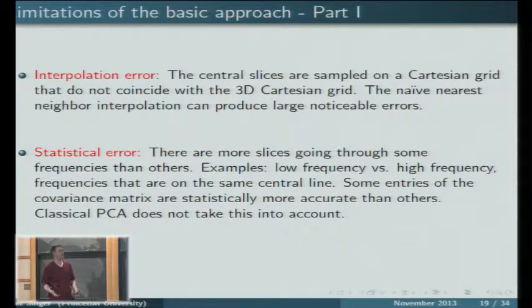And by doing so, we introduce some error. And this error is going to get larger and larger as we go to high frequencies, because then just imagine planes that start deviating from one to another. So getting the high frequency is going to be more challenging for us.